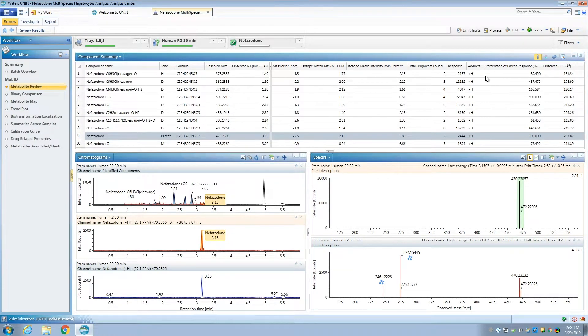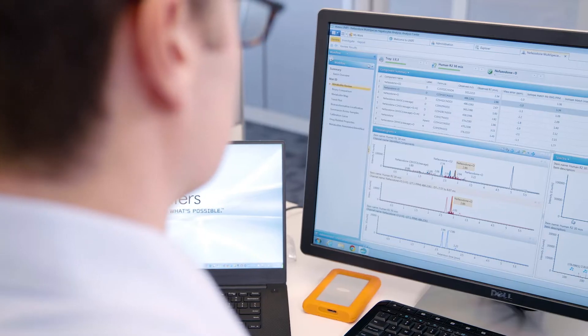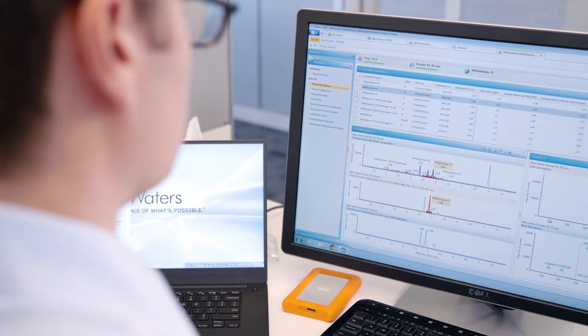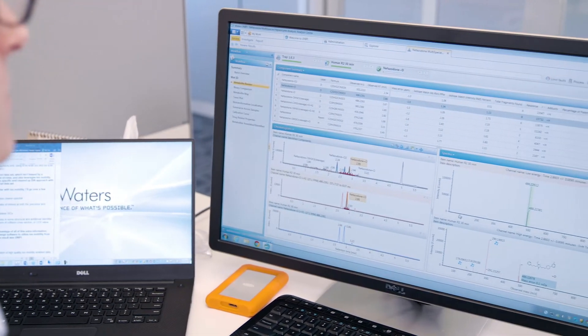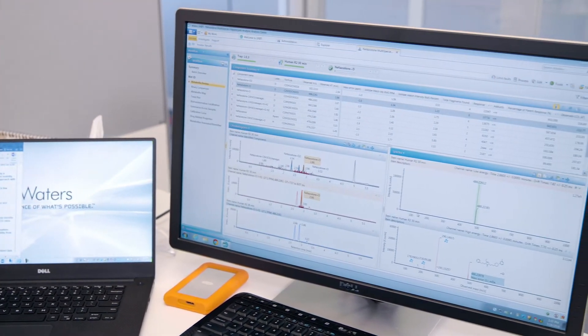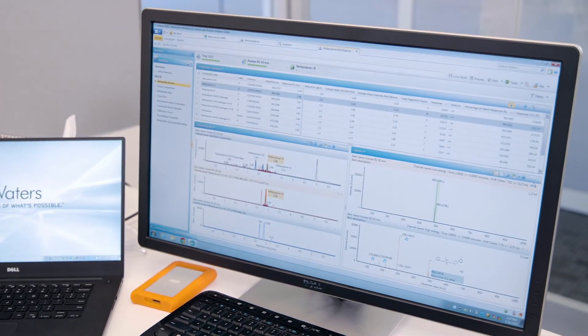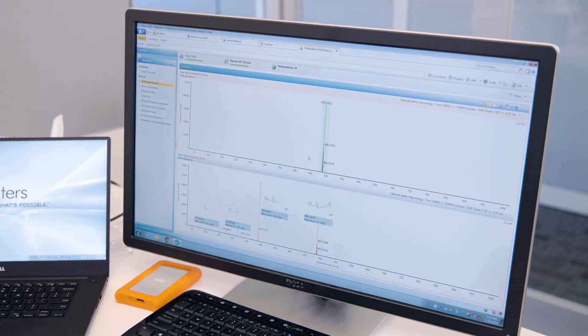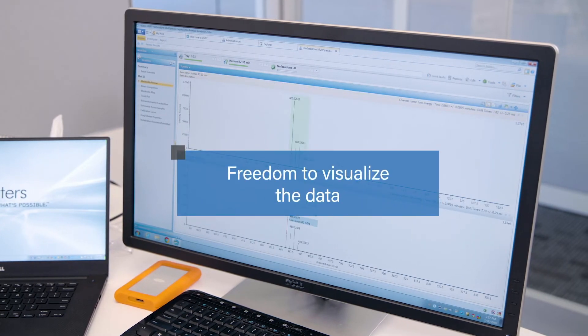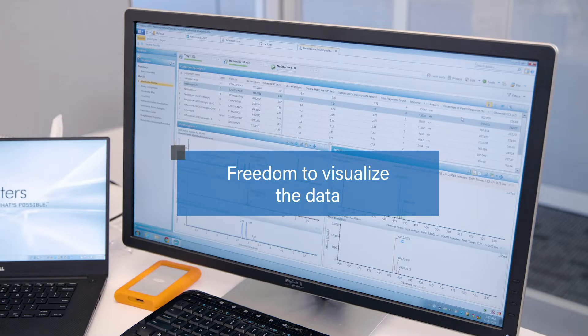It's important to note, ion mobility enabled workflows also work for non-ion mobility enabled data sets, as well as DDA and MS/MS data, so you have the freedom to visualize the data as you wish.